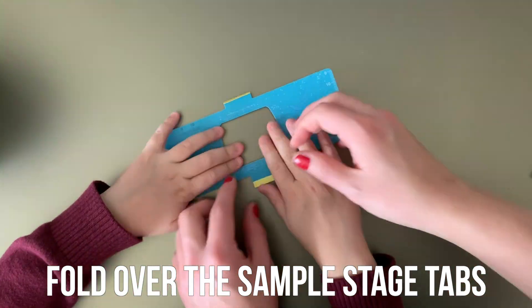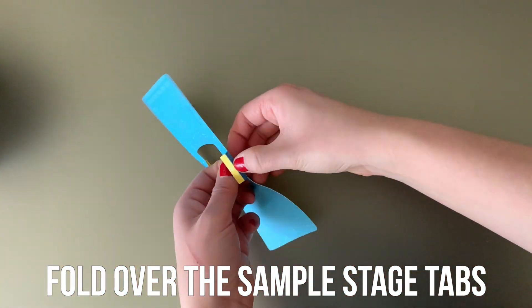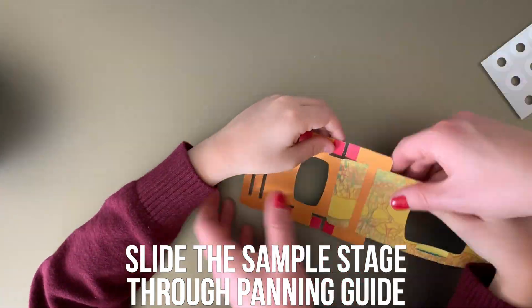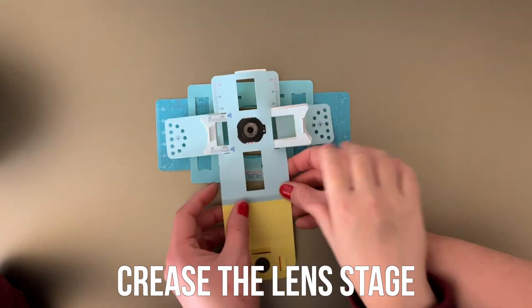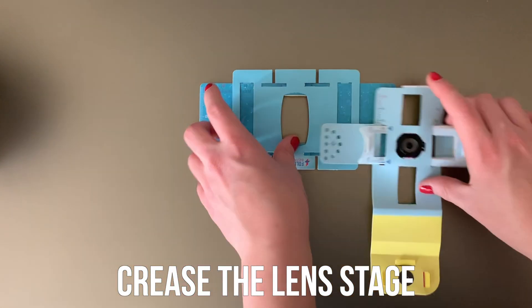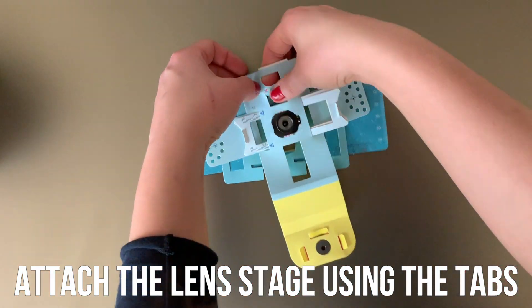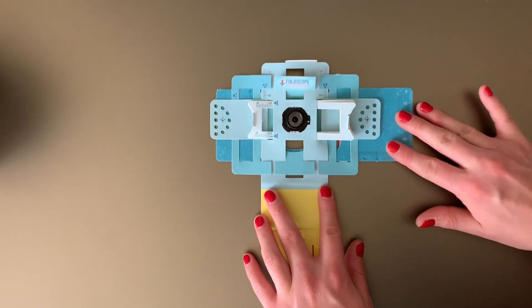Next up, fold over and tuck in the Sample Stage tabs. Then slide the Sample Stage through the Panning Guide. Crease the Lens Stage by folding over on all of the scored lines. Attach the Lens Stage to the Panning Guide using the tabs. Your Foldscope should then be able to move up and down.